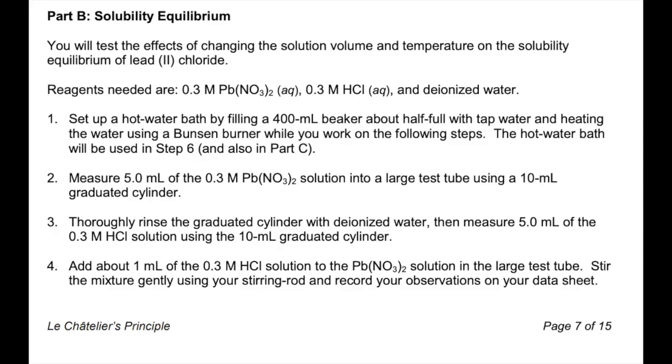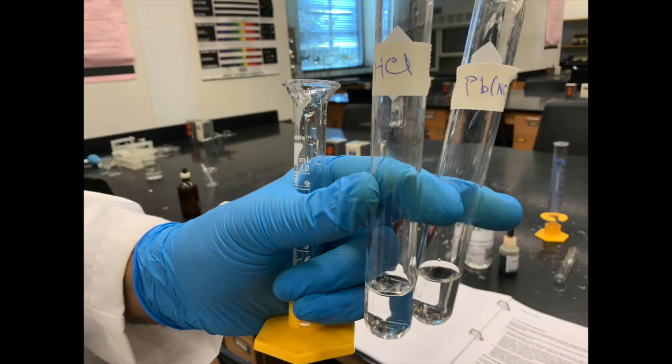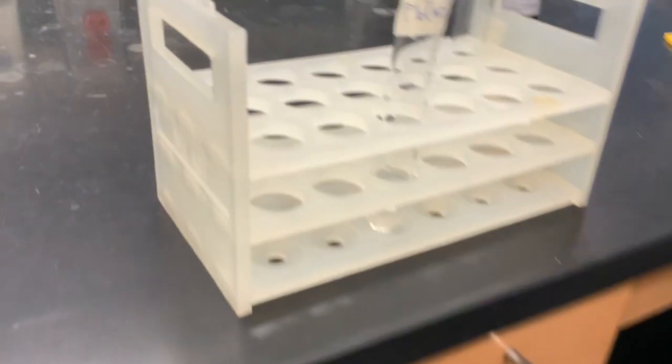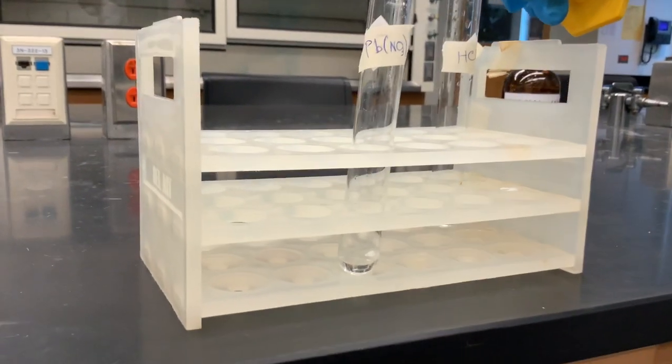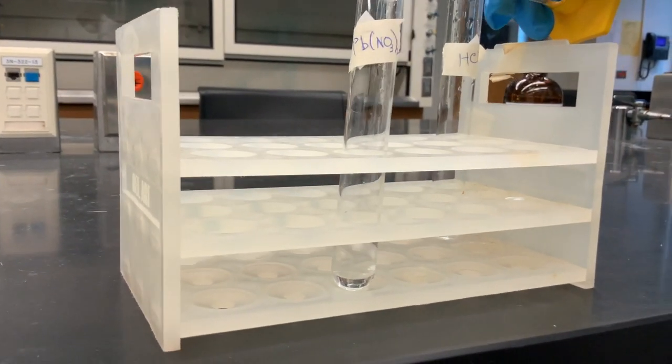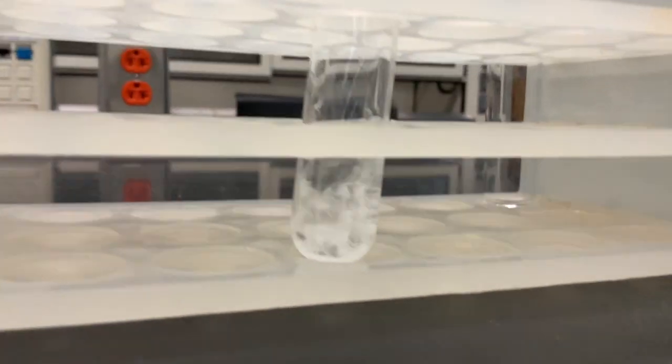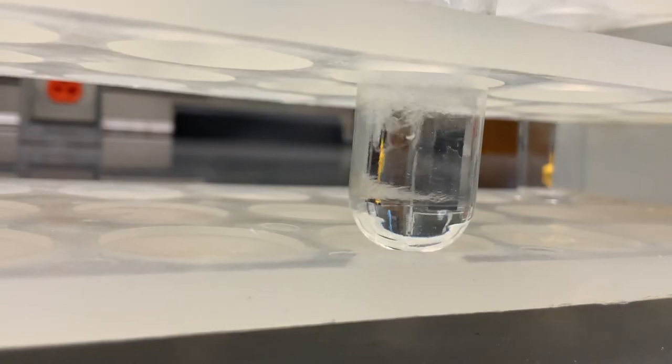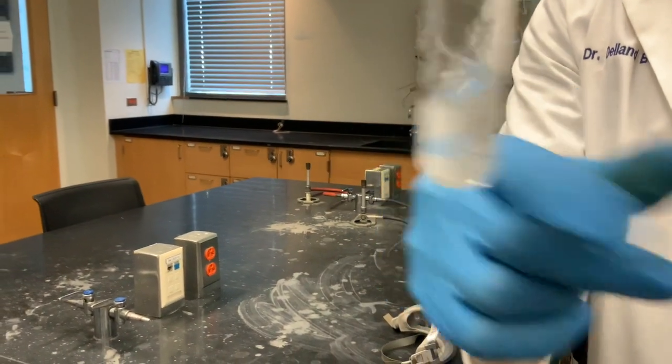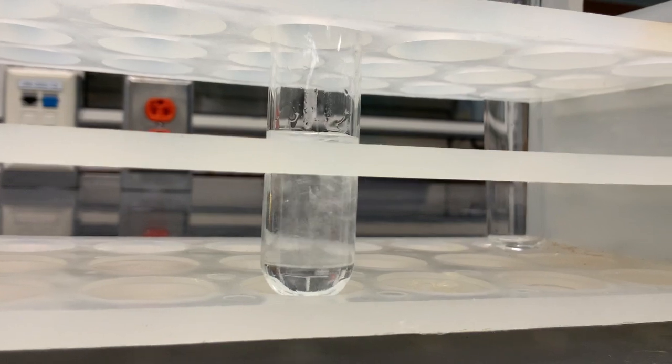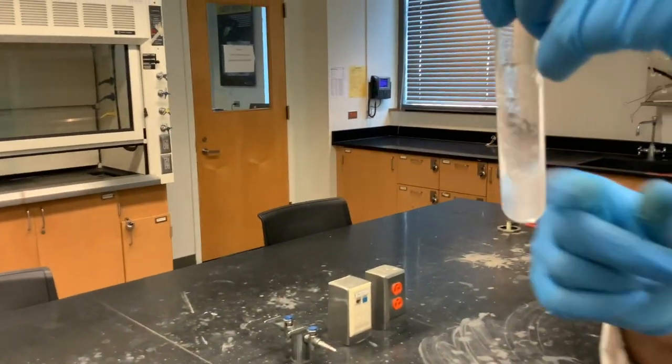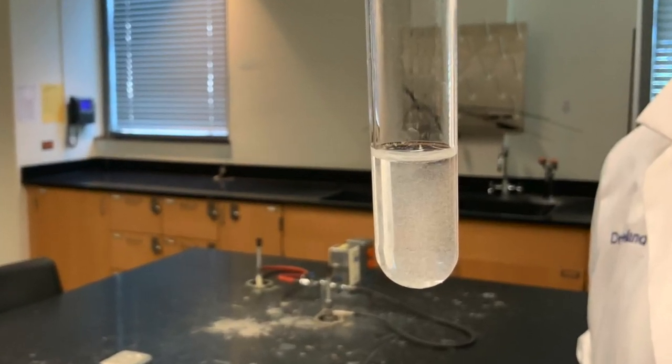We then move on to Part B, which explores the solubility equilibrium of lead chloride. Here we measured 5 ml each of 0.3 molar lead nitrate and 0.3 molar hydrochloric acid. We then add 1 ml at a time, the HCl solution, into the lead nitrate followed by gentle stirring. Observe what happens and record it in your lab report. We add another ml of HCl and then mix it again. Then we add another ml and stir it again. Record what you see in your lab report.